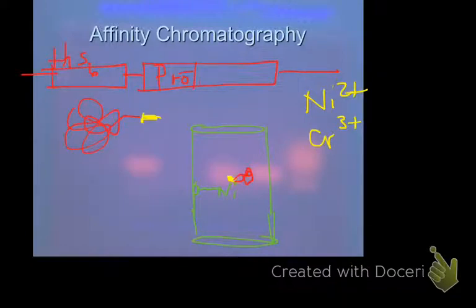Well, in particular, rather than histidine, you just compete it with imidazole. The imidazole ring is that ring part of histidine. So this one uses imidazole. Remember, histidine looks like home plate with the two nitrogens. That's like imidazole. So you just add higher concentrations of imidazole, and it will bump your protein off. Okay? And so it works really well.